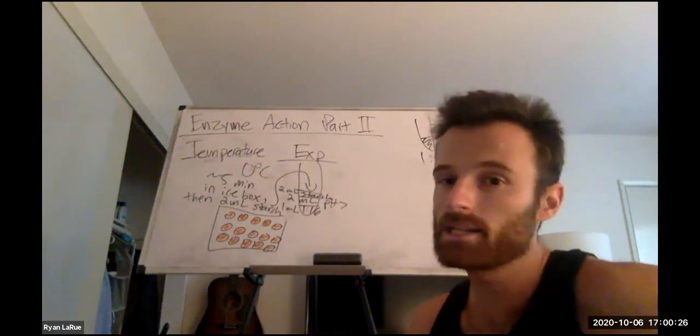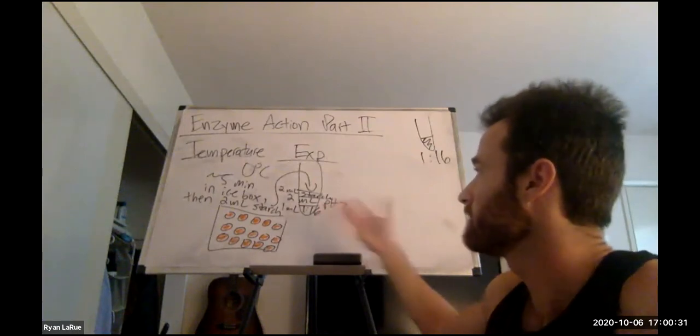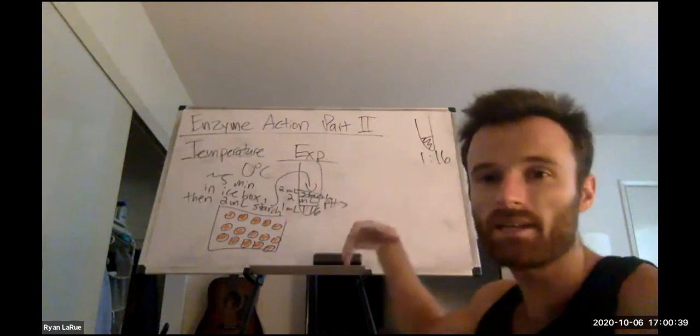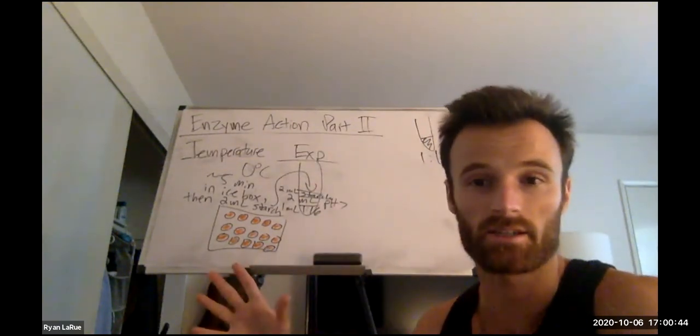And the saliva itself might be slightly acidic. The starch maybe.